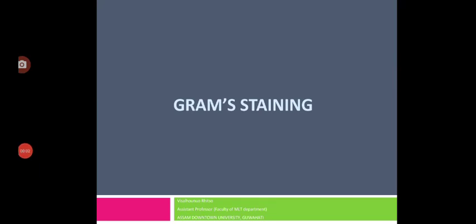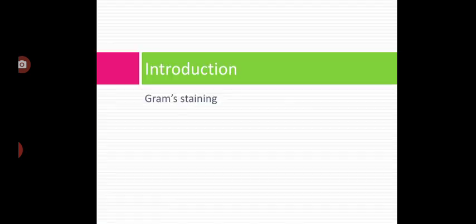Hello everyone, in this video I'll be explaining the topic of gram staining. Gram staining is a staining technique, also called differential staining, because this stain differentiates all the bacteria into either gram positive or gram negative bacteria.